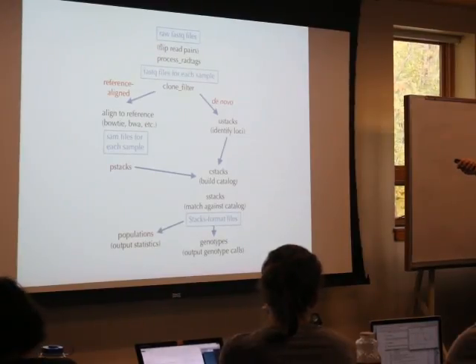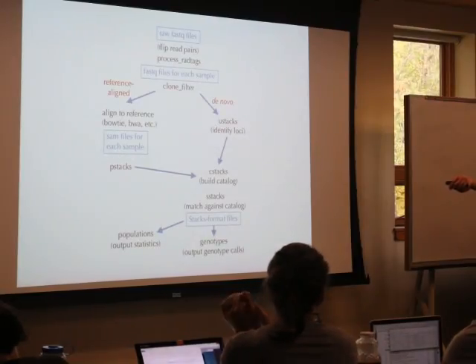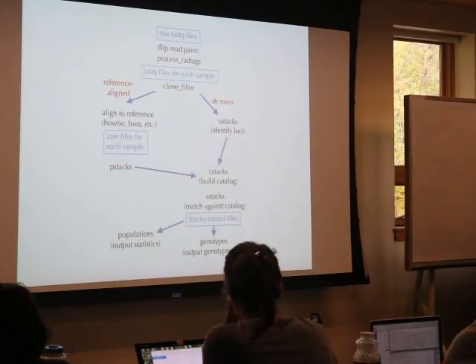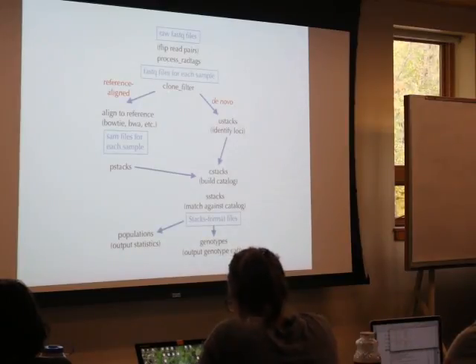These are some part of SAM tools, I think, where basically you would skip the step here, go down, align all your reads, and then run it through PCR duplicate removal that removes things based on whether or not they have identical alignment positions for the forward and reverse reads of any 2 pairs. So there are different options for removing PCR duplicates, but again, they all depend on paired ends.